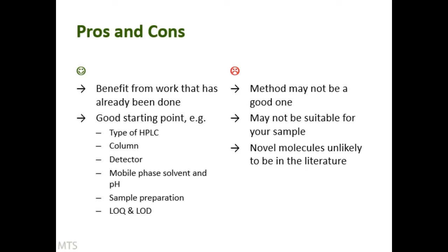So mobile phase too, the solvent and the pH, see what other people have done. The sample prep, I mentioned derivatization, but it could be other things. It can be really helpful to see what other people have done. And also the sensitivity of the method. So I find this quite useful when I'm doing literature searches to support customers sometimes to see, well, what level did other people get? What signal to noise did they get? Is it going to be fit for what I wanted to do? Am I going to have to think again? So that can all be really useful.